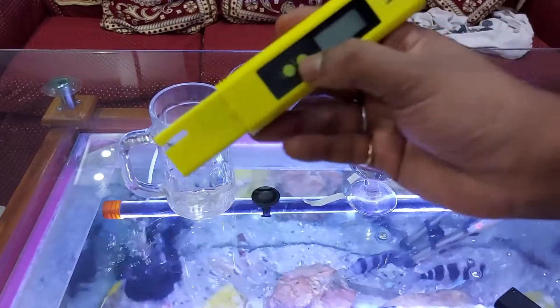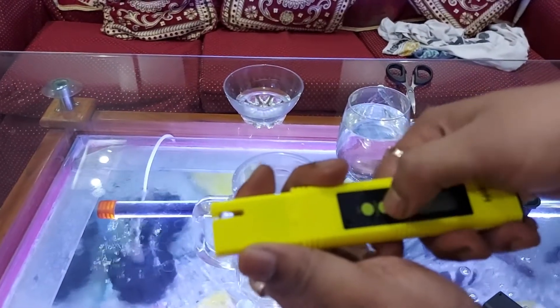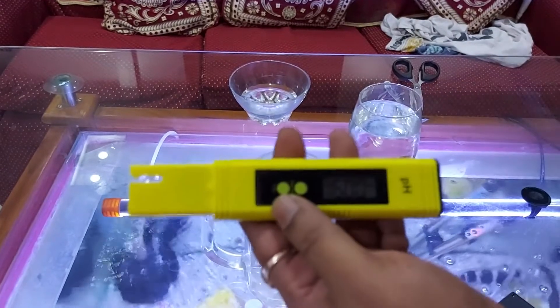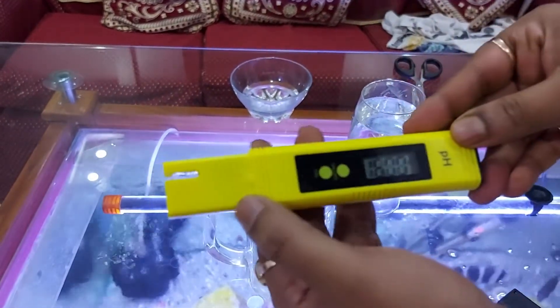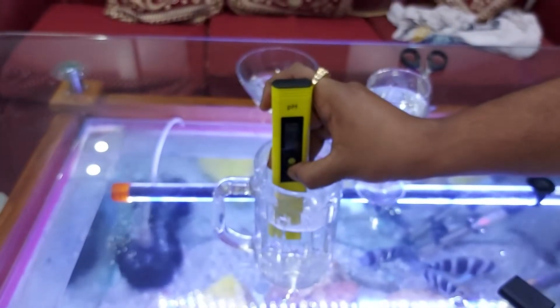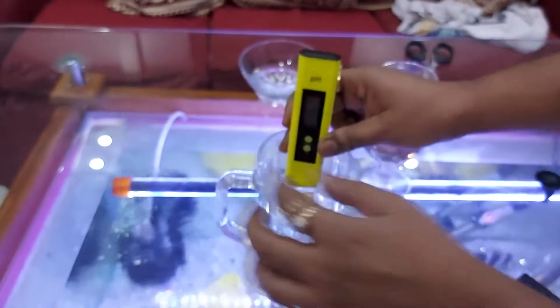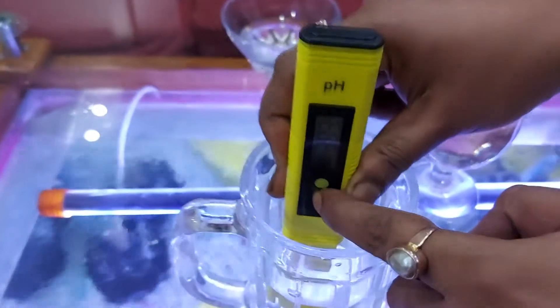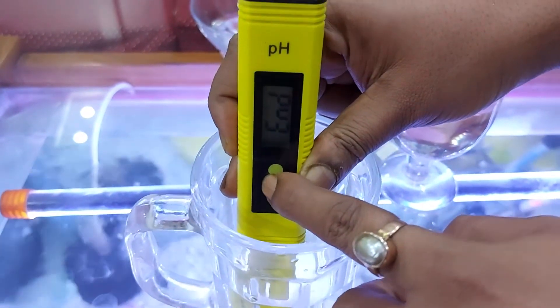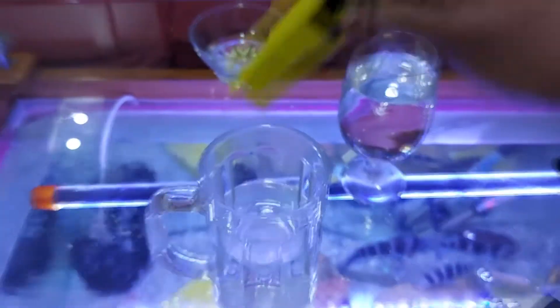After that, take the pH meter like before and turn it on. Press the calibration button for five seconds, then release it and press it just once more. Press for five seconds — it will blink 4.01 — release and press again. It will show 'END' and the calibration is now complete.